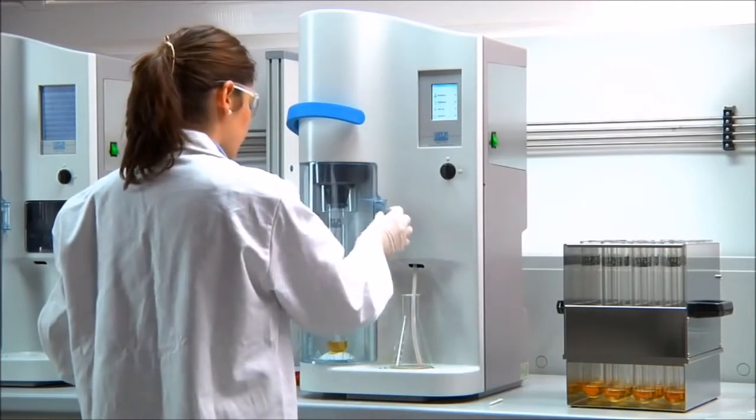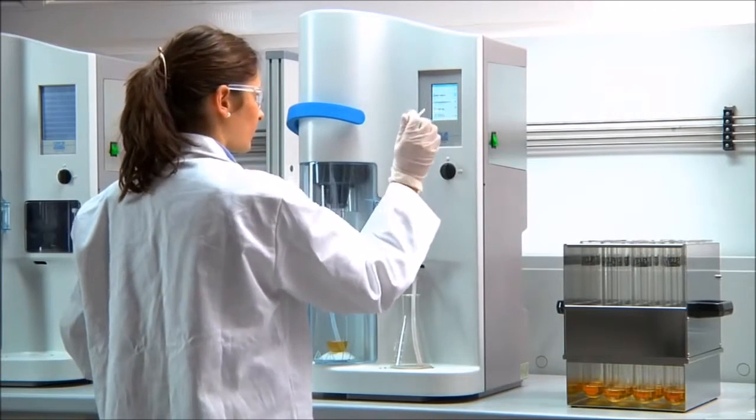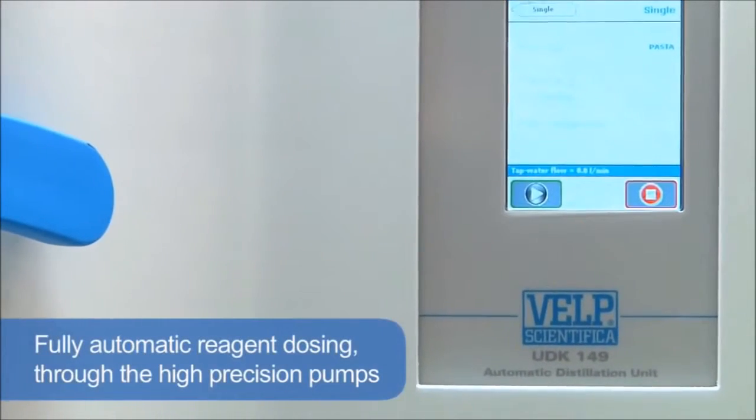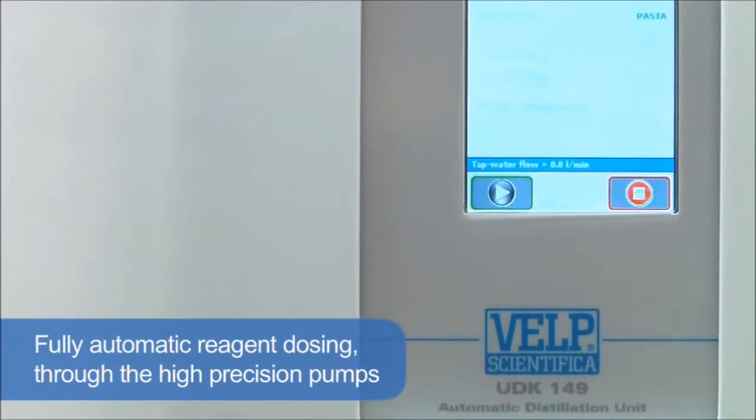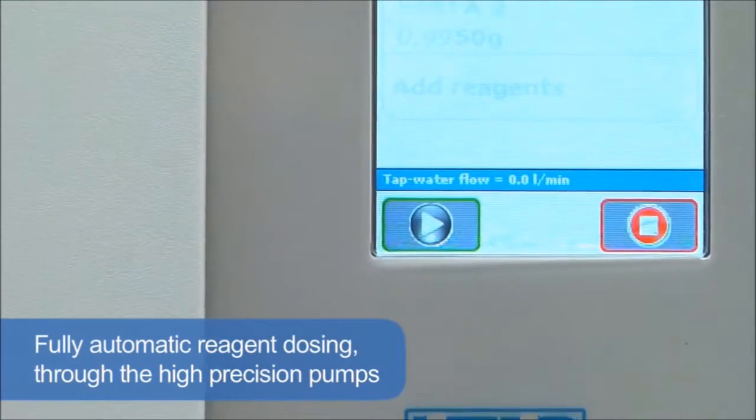The distillation takes place securely behind a transparent door. The unit ensures simple and safe operation with reliable analytical results, thanks to the fully automatic reagent dosing through the high-precision pumps.